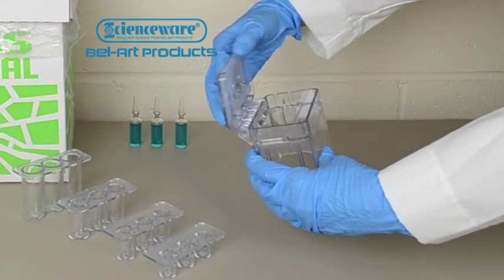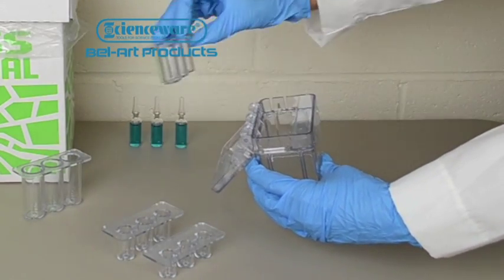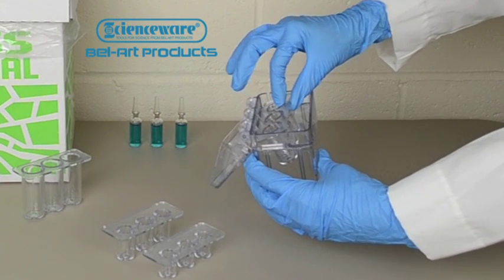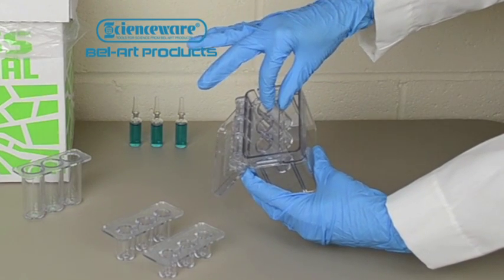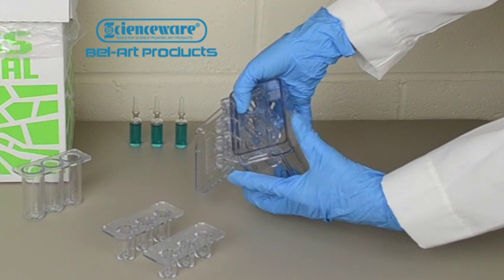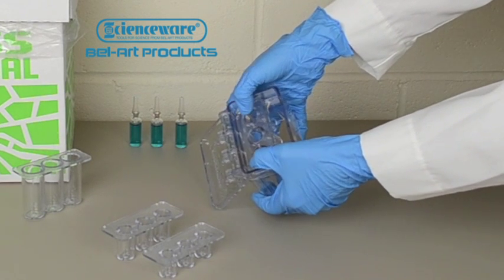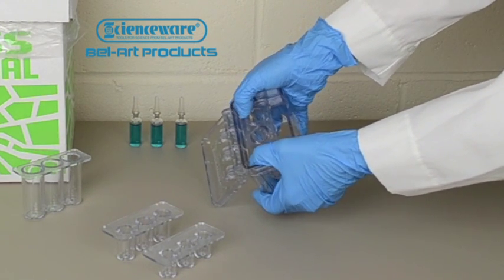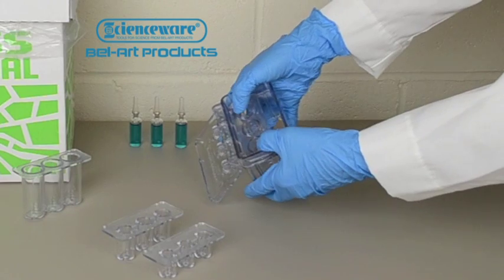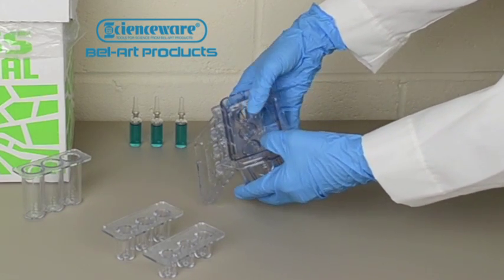To install an insert, place the insert into the opening and then tilt it back at a 45 degree angle, inserting the back edge under the immobilizing lip located on the back wall of the ampule opener. Push down gently on the front of the insert until it is locked into place and there is no movement.